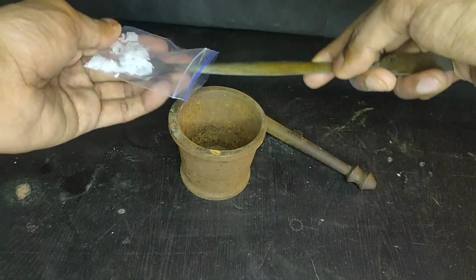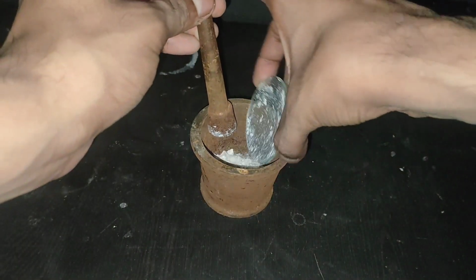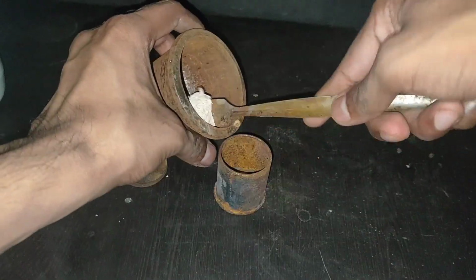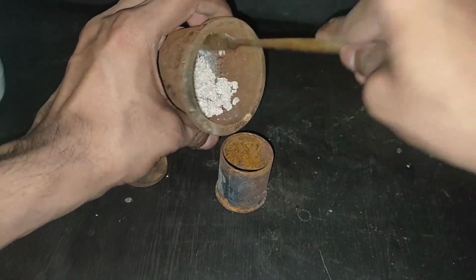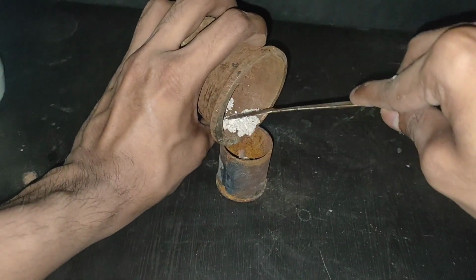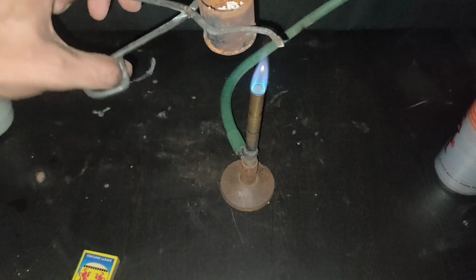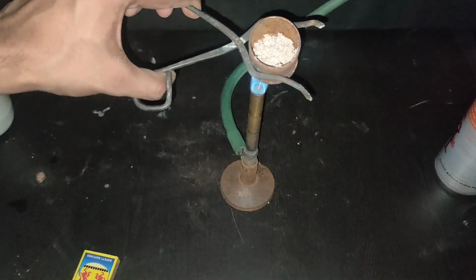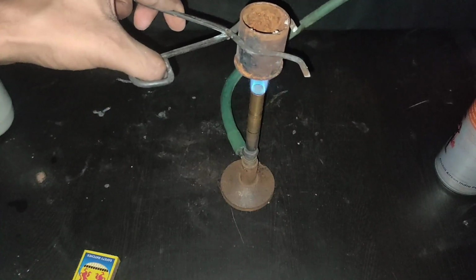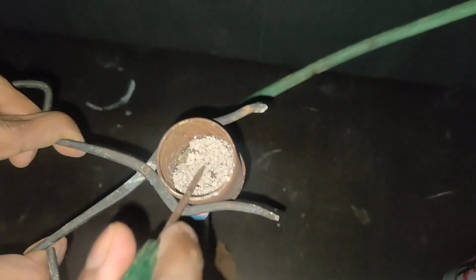Now in a mortar and pestle, I took 2 grams of sodium hydroxide. To this I added the sodium naphthalene 1-sulphonate and ground them into a fine powder, and then I transferred all the powder into a metal container. I then heated this powder on a low flame until it melted. I used a screwdriver for stirring the contents.